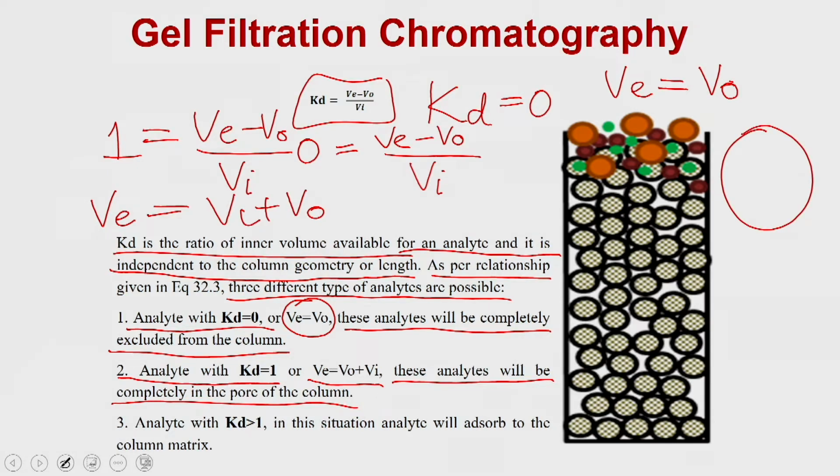If you see the beads, the molecules which are sitting at the innermost area of the beads are going to give you a Kd value which is 1.